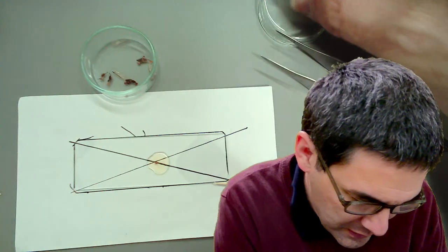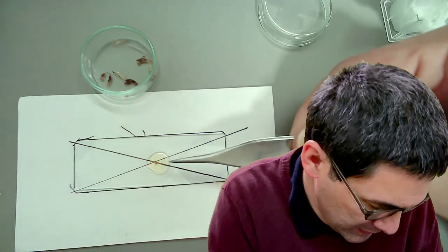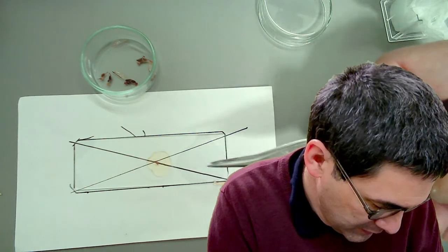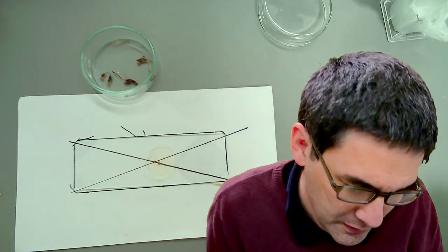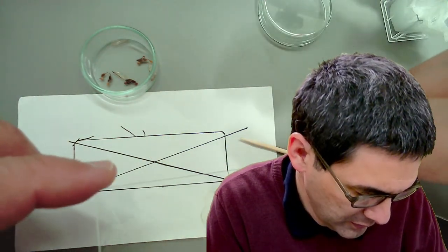And here is the cover glass. You can use your fingers, of course, but I sometimes prefer using a tool. Yeah, this could be pretty much in the center. Okay. Hopefully this is in the center. Let's have a look here.